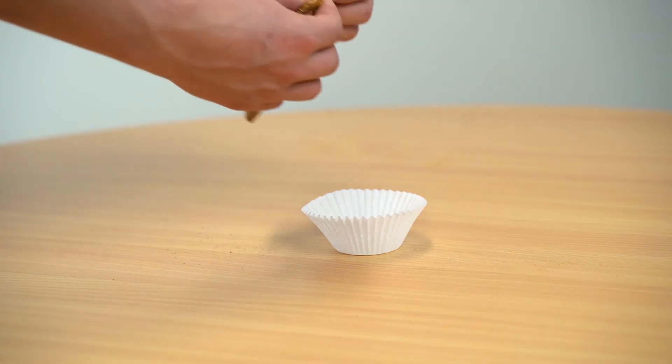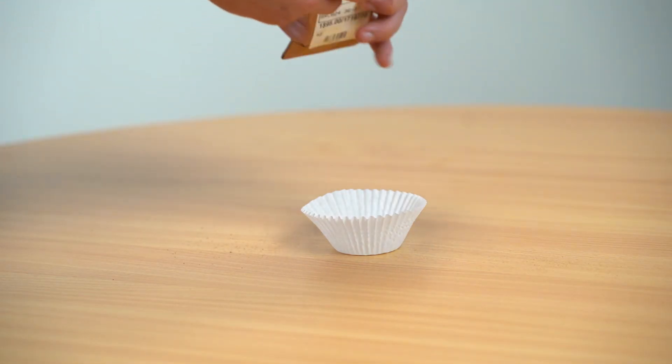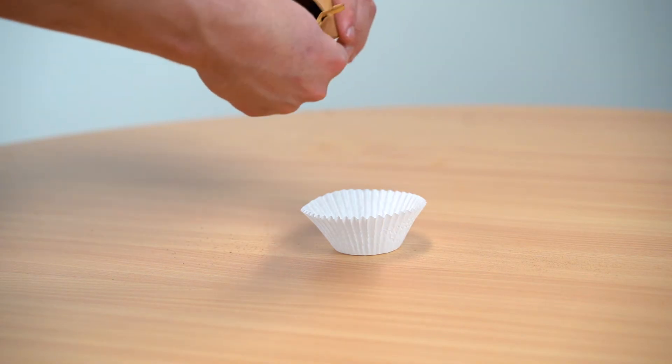Best practice for taking an analysis of a pulp sample is to take the sample out of the bag and place it on a clean surface. You'll want to avoid analysing through a bag, as the bag will also be included in the measurements and skew the results.